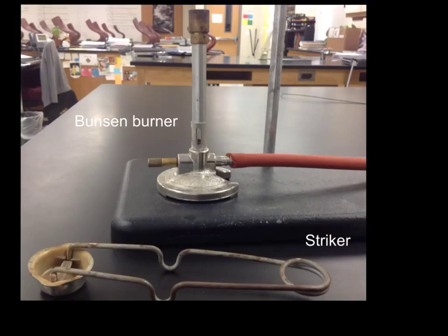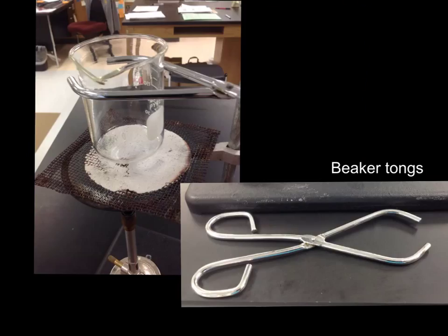You can also use it to heat a beaker over a Bunsen burner. You would want to use beaker tongs. These tongs are specifically for picking up hot beakers and moving them on and off the ring clamp that is suspended over the Bunsen burner.